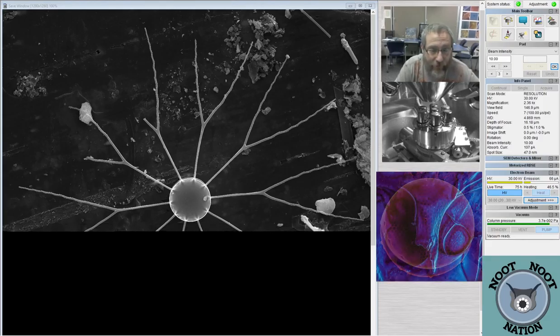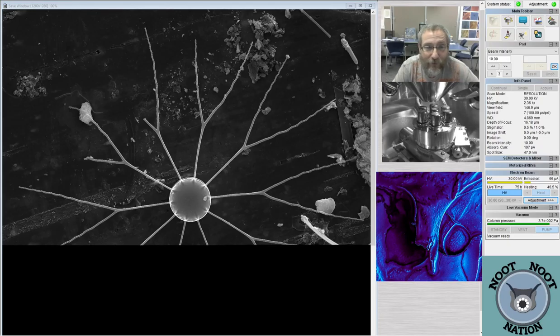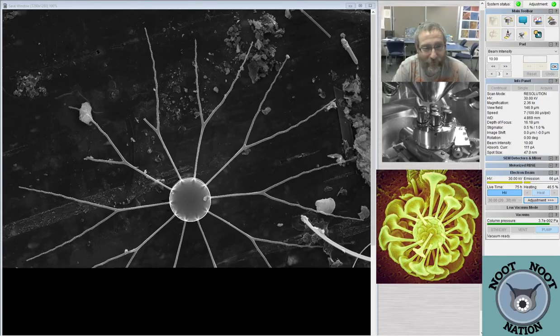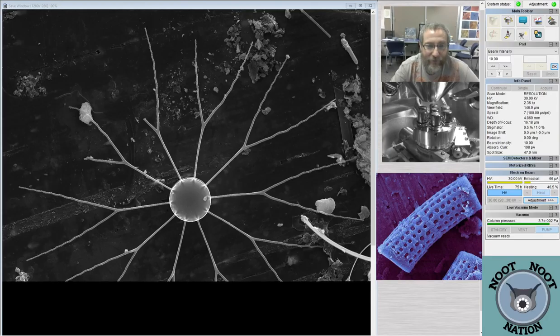Also, I could then recognize a marine diatom when I see one. I usually know it's a marine diatom when I see one because I don't know what it is. It's like, I don't know what this genus is. And usually if I don't know what it is to the genus level, it doesn't belong in freshwater, because I've looked at a lot of different material from freshwater, and usually I can get stuff into the genus.